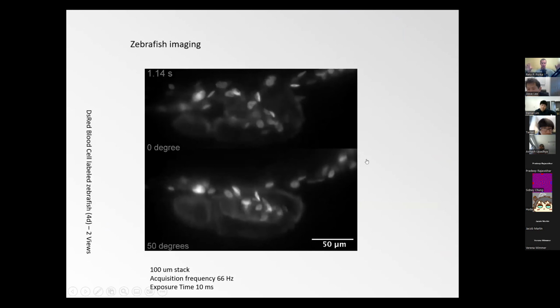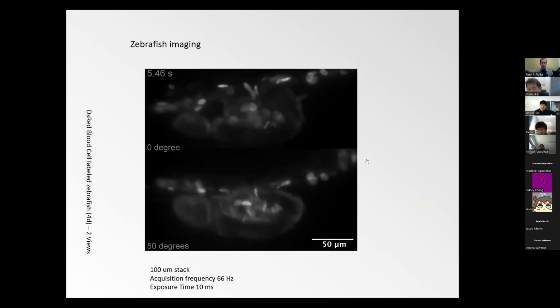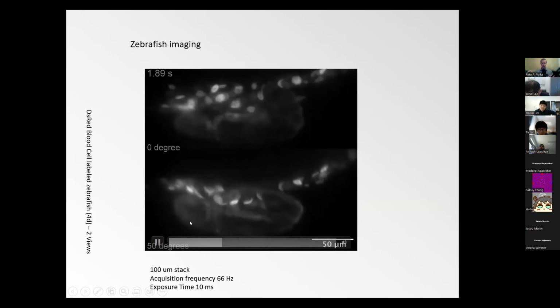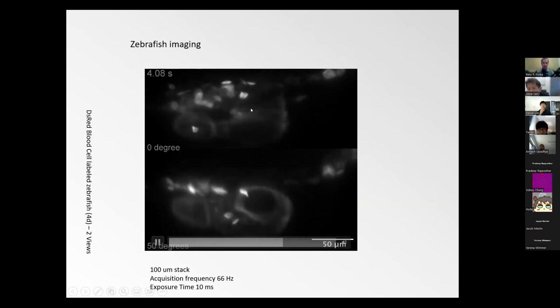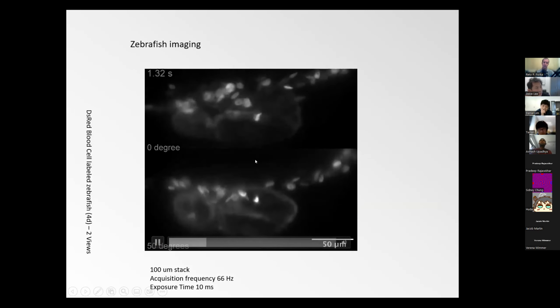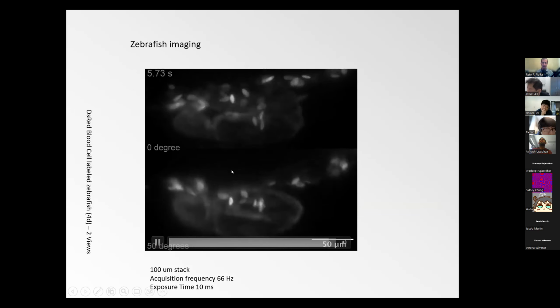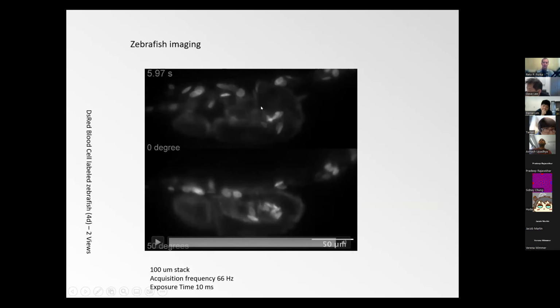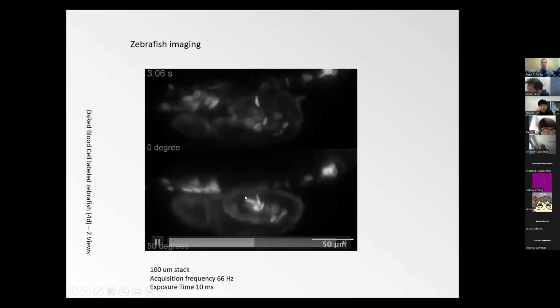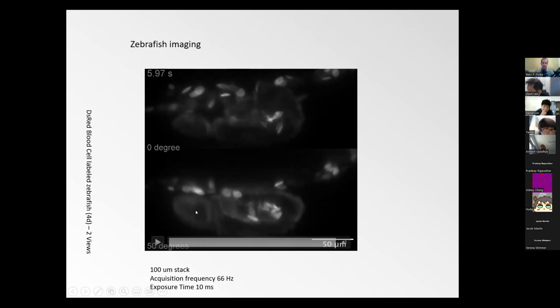So you can also quickly acquire different views. For example, this beating zebrafish heart, young zebrafish embryo, we imaged alternating at, say, 0 and 50 degrees viewing angle. So you get two views of this volume as the heart beats. This was done sequentially. You can also build an optical apparatus that can put two different projections on two cameras. But nevertheless, if you were to acquire a stack, you would have a hard time keeping up. If you would acquire hundreds of slices, they would not be synchronous, and so your view of this 3D sample would be kind of blurry or jagged.